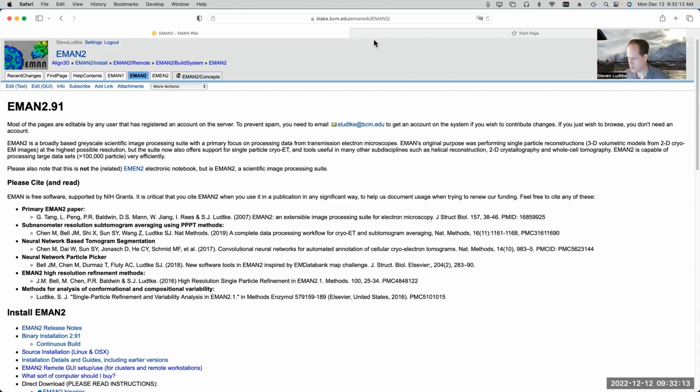So we're going to talk about the Gaussian mixture model stuff today. I will point out this is still kind of a work in progress. It's an active area of research, both for me and somewhat separately for Muyuan. So there are still a lot of active changes going on, but it's at the level now where you can use it for a bunch of things.